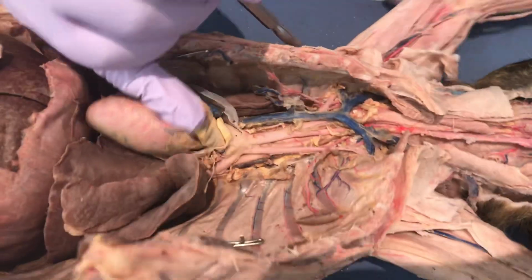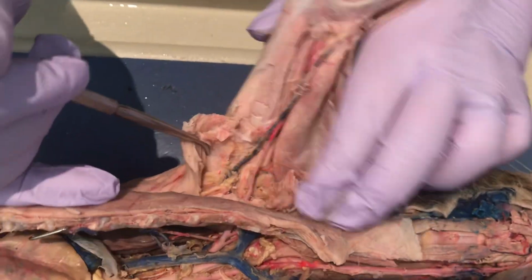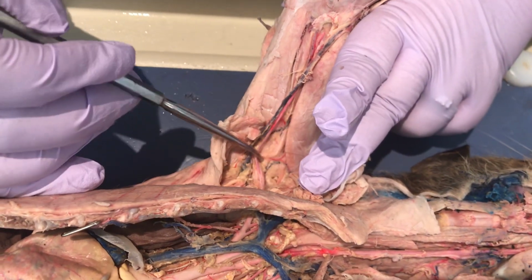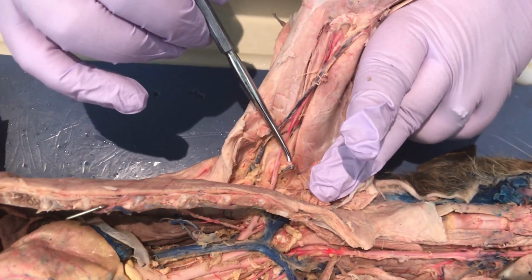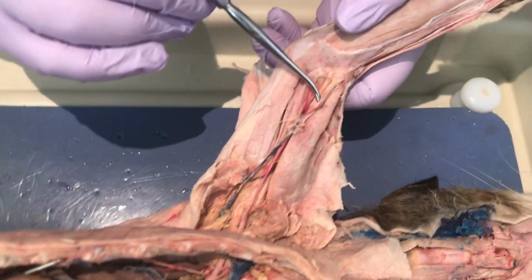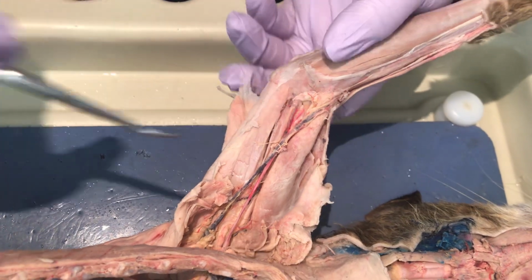All right, heading out into the arm. As soon as the subclavian crosses the chest wall, it becomes the axillary artery, and it will change names again after we cross the subscapular artery. So axillary, subscapular, brachial. The brachial comes up and divides into radial and ulnar artery.